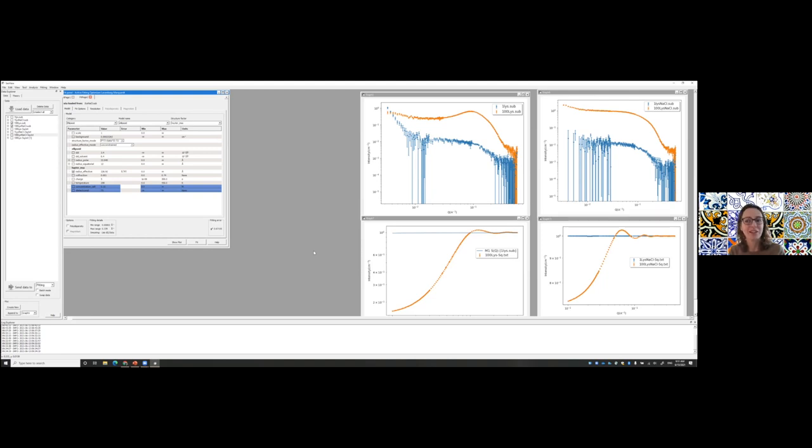If you had divalent ions, that can be adjusted in the model. Again, if you read the reference, it will tell you how to do this, so you can adjust the parameters to take this into account. But be careful with that too. The type of ions also matters, of course.